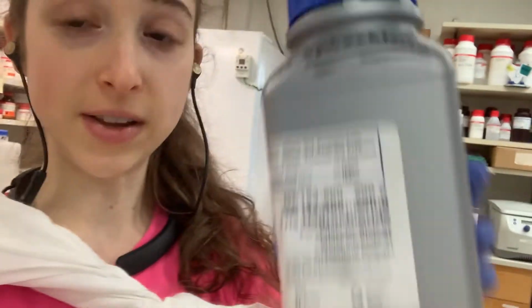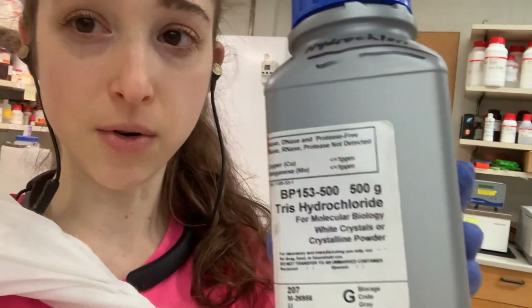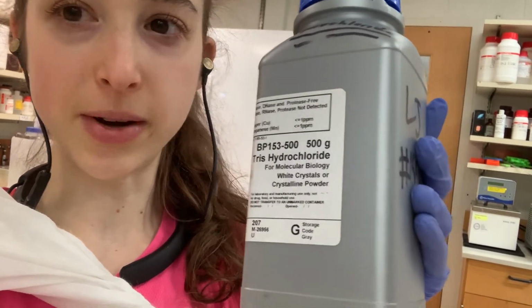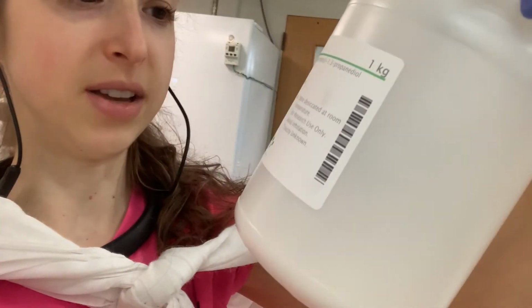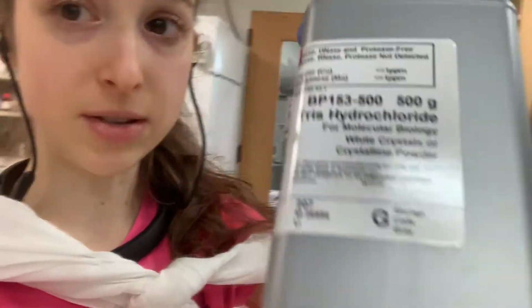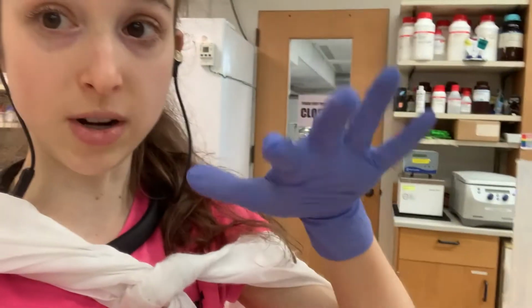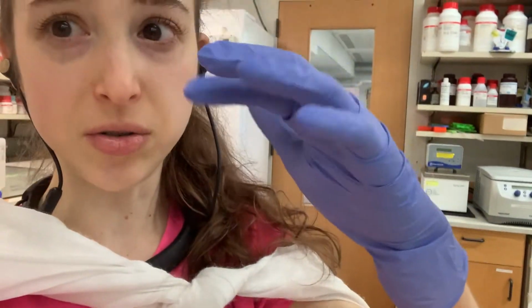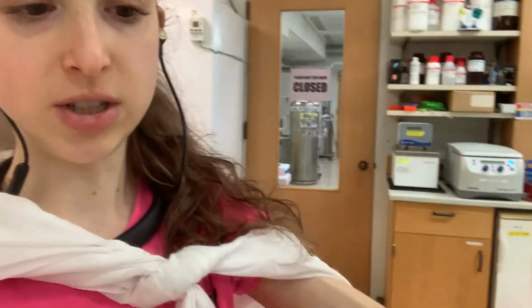If we dissolved just the acid form, I think a 50 millimolar solution would have a pH of 4 point something, and the base would have a pH of 10 point something. This is going to be too high for what we want, and this is going to be too low. So if we start with just one of these, we're going to need to adjust the pH. You can calculate how much of each you need to add to get to a desired pH, but in practice, what we typically do is just make it from the base and then adjust the pH down.